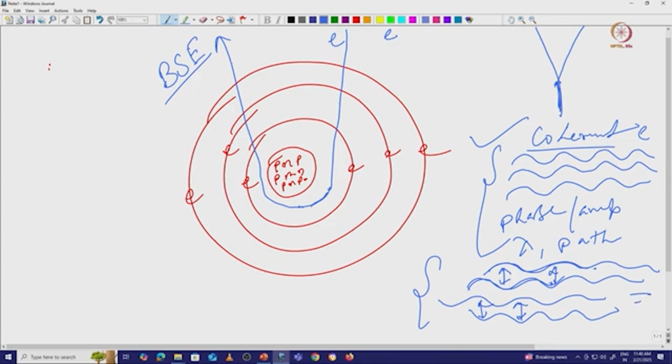So, we can always consider that when electrons are coming from the electron gun, most of the time the electrons will be coherent until they interact with the atom. So, we will just consider that before interacting with the sample, all the electron beams are coherent electron beams. In practical case scenario, that is not the case, but we are just considering it for now.